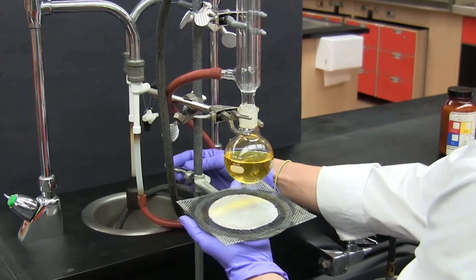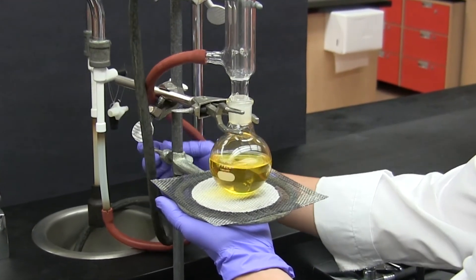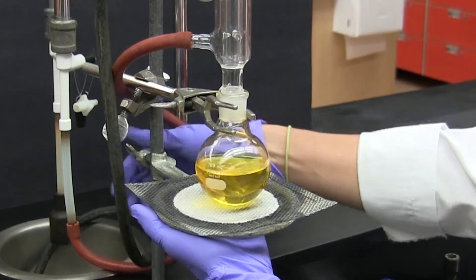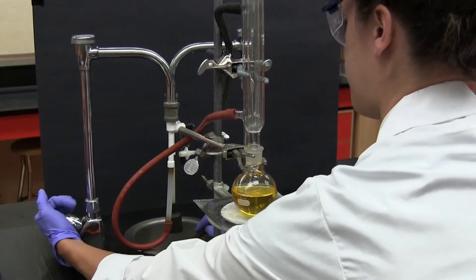A wire gauze supported by a ring is placed directly underneath the reaction flask. The wire gauze will help to distribute the heat from a Bunsen burner. Before heat is applied the water flow is started.